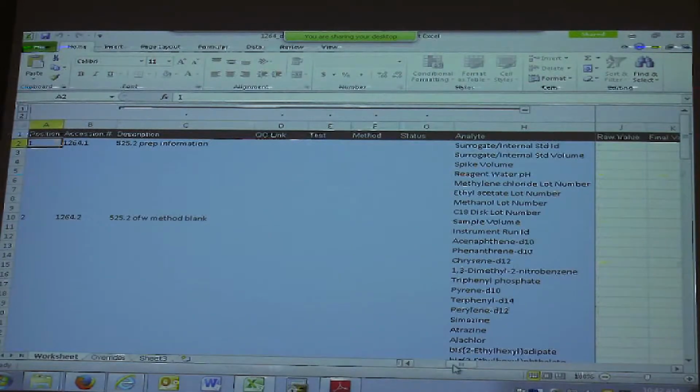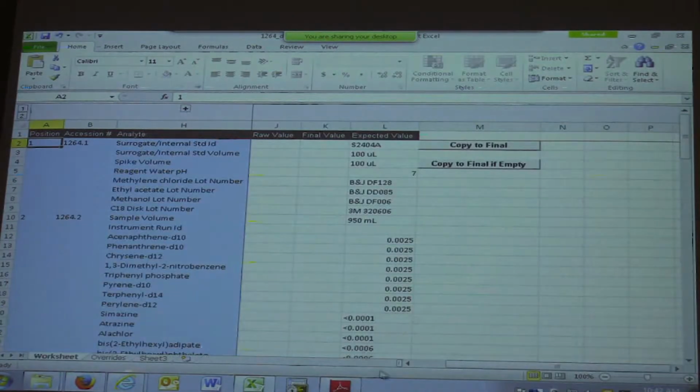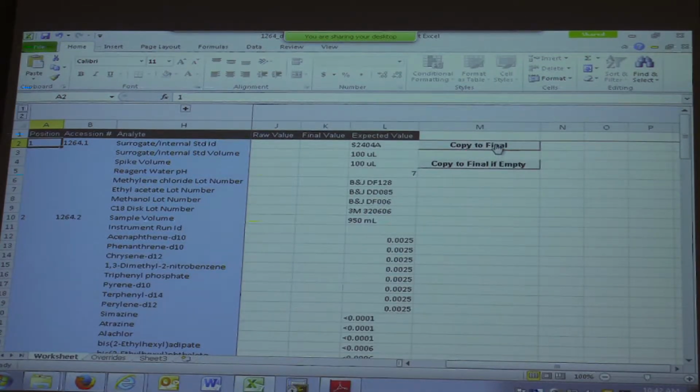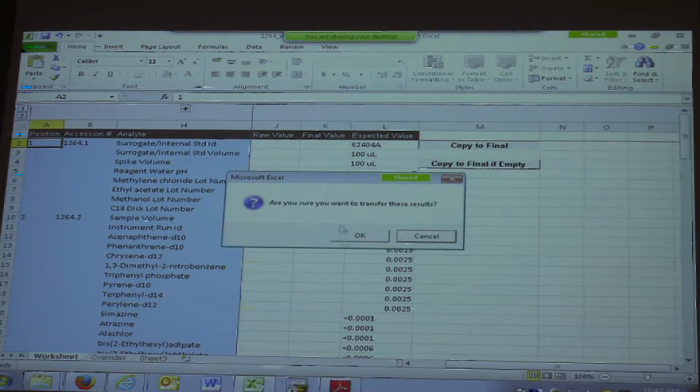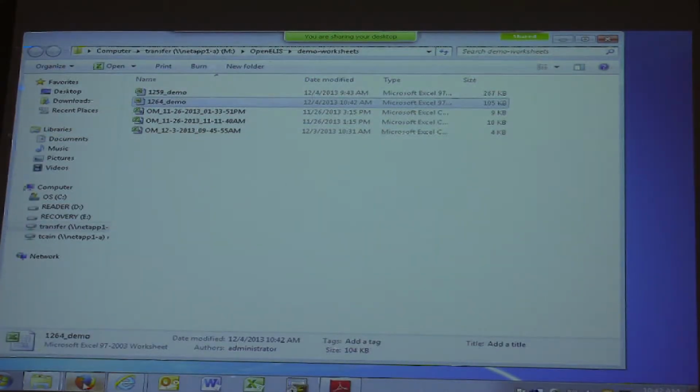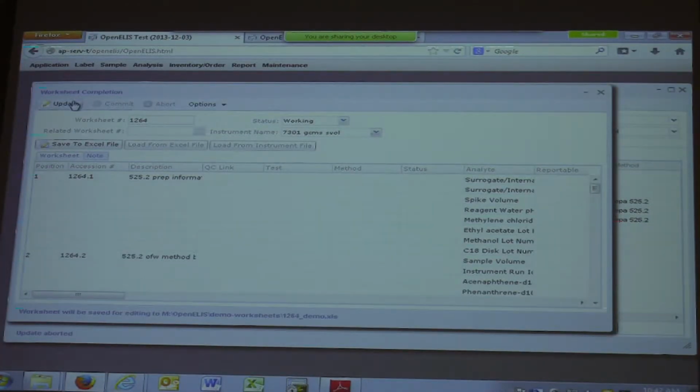I don't think I'm going to put anything in here. I'm just going to save it out. And I'm not going to do the times on the overrides either. I'm just going to save it. Okay. Done, I guess.